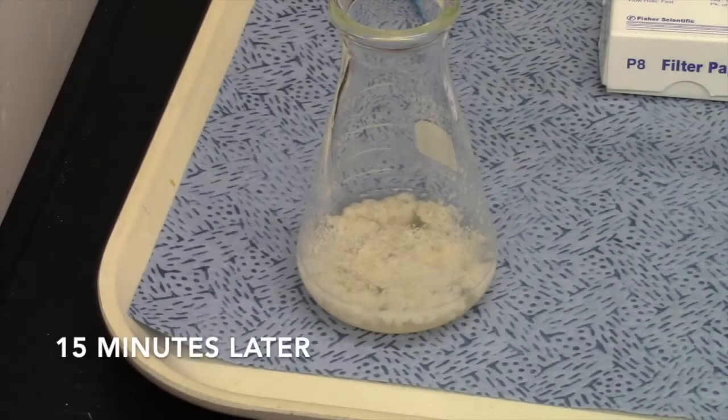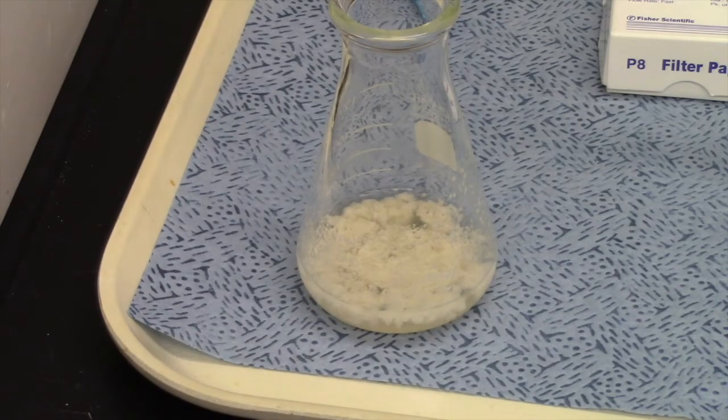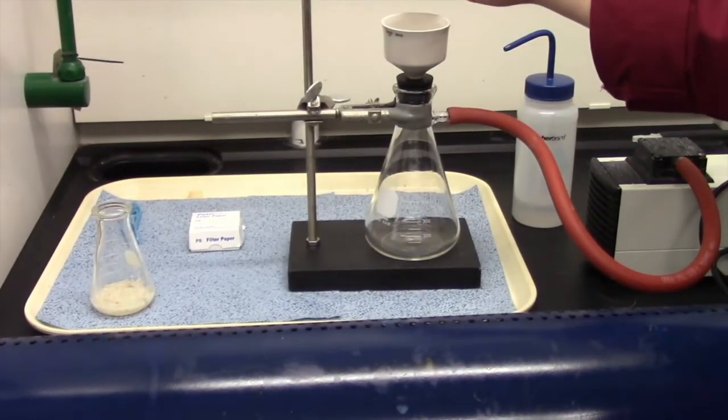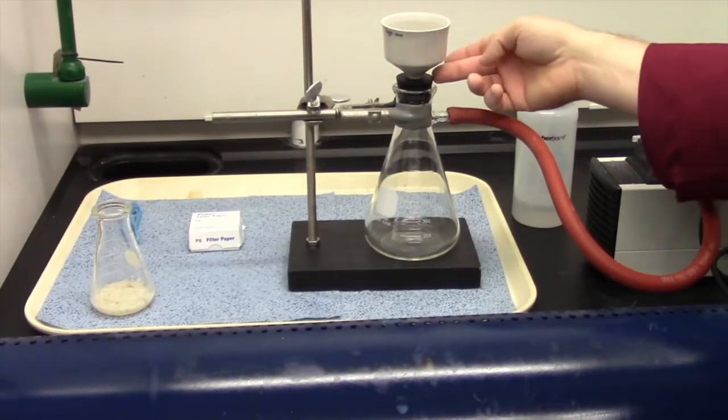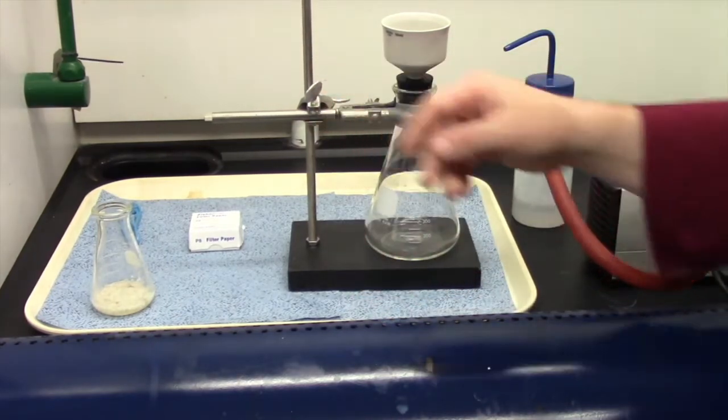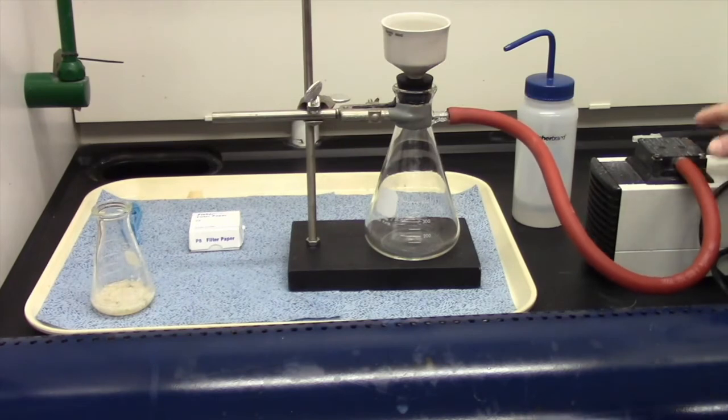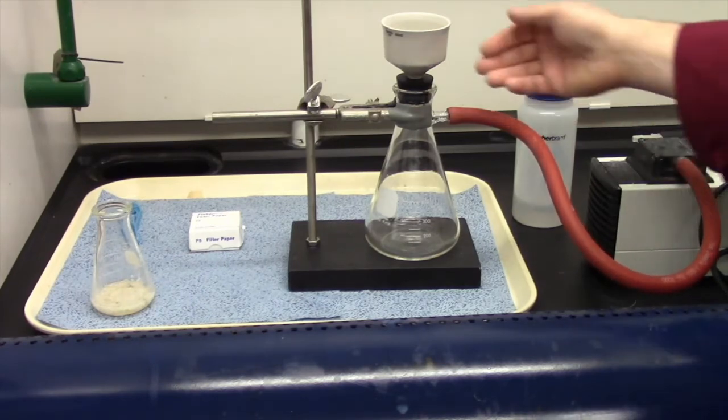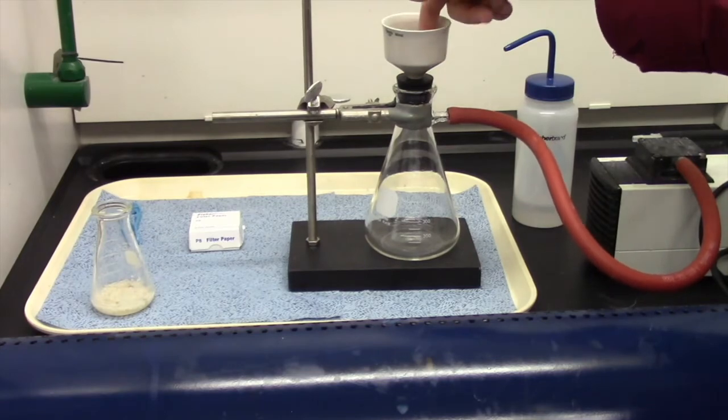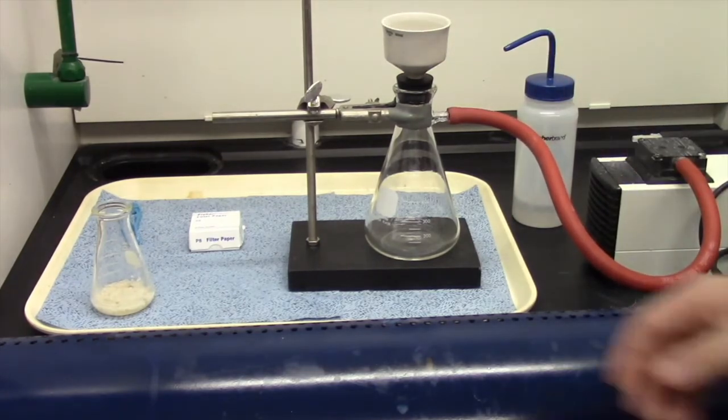Alright guys, we've waited about 15 minutes and as you can see, our flask is now filled with soap. Isn't that kind of cool? That is soap floating right there in suspension. Now here we have what's called a Buchner funnel. It's a rubber stopper, it's a vacuum flask, and of course a clamp stand and a clamp. And this bad boy right here is a vacuum pump. It's going to pull the air out of here, it's going to pull the air through the funnel, which is going to help us filter our sample a whole lot faster.